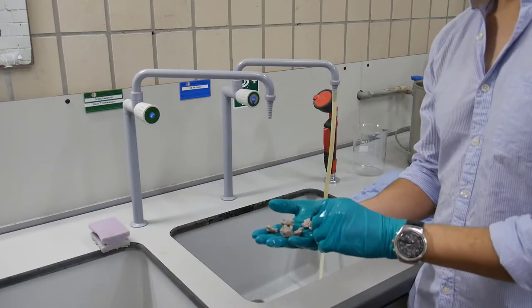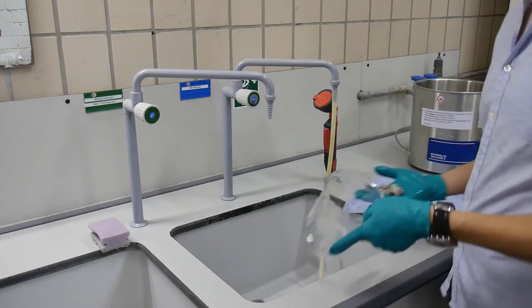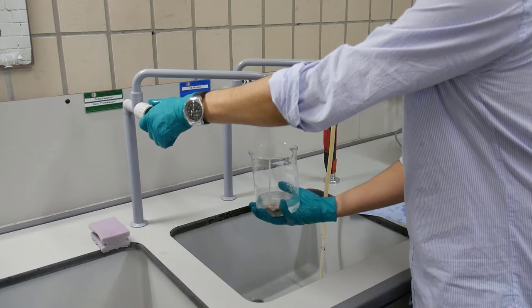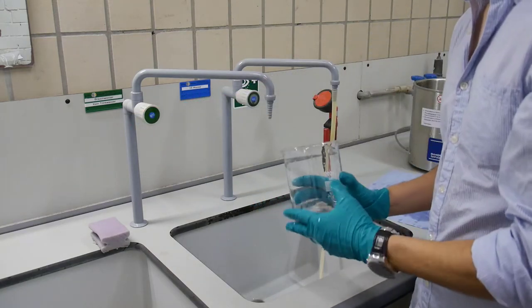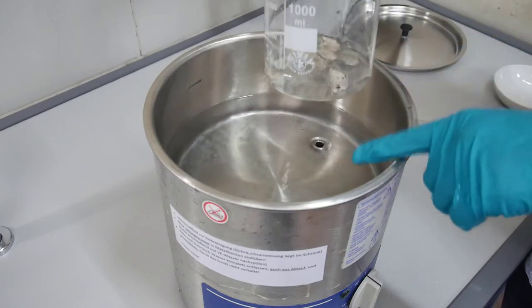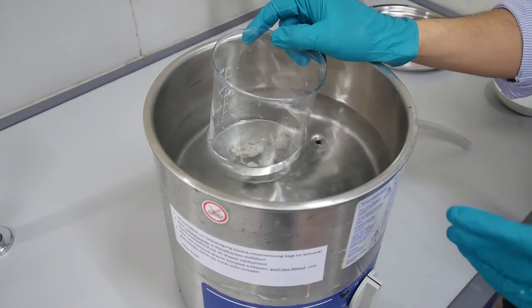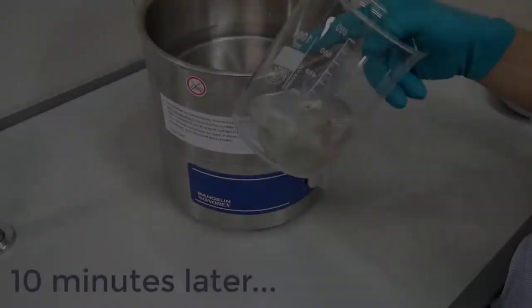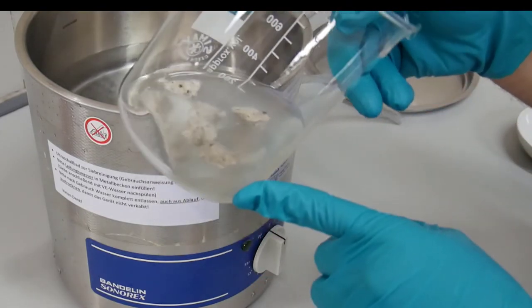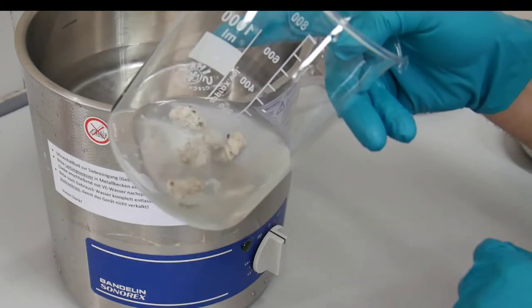Once you have cleaned all the different pieces, we can also put them into the ultrasound. For that we need a beaker — we just put it inside the beaker, add some water, and bring it to the ultrasound. We put the samples with the beaker inside the ultrasound that also contains water. We can leave the sample inside the ultrasound for around five to ten minutes. Even though the rock pieces were brushed before, we can see there was still a lot of remnant dirt in the samples, so this is why ultrasound is very useful.